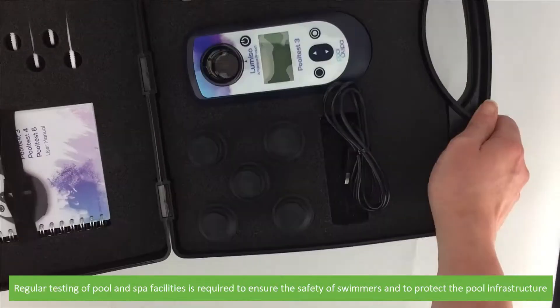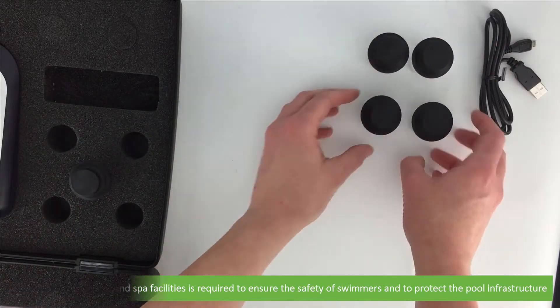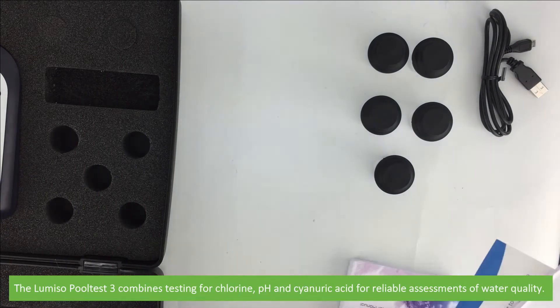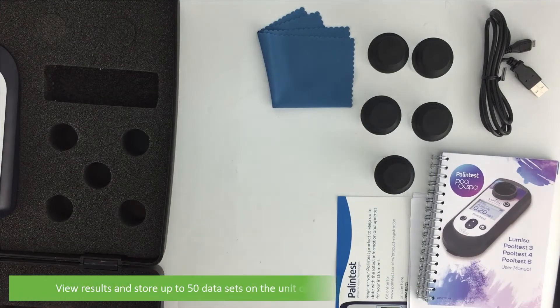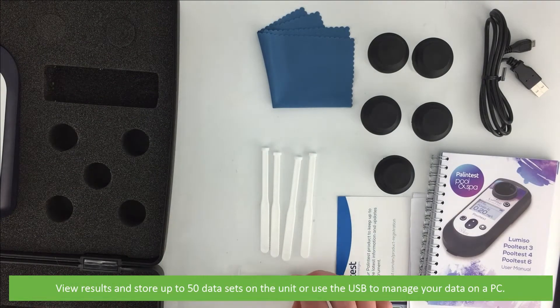Regular testing of pool and spa facilities is required to ensure the safety of swimmers and protect the pool's infrastructure. The Lomsio Pool Test 3 combines testing for chlorine, pH and cyanuric acid for reliable assessments of water quality. You can view results and store up to 50 data sets on the unit or use a USB to manage your data on a PC.